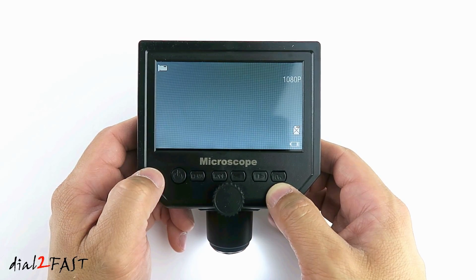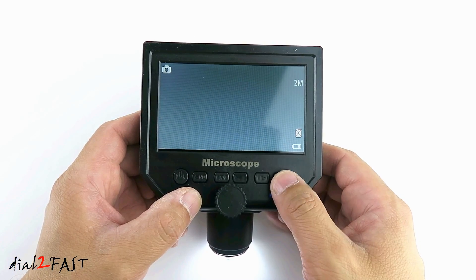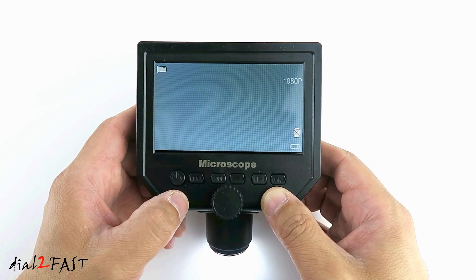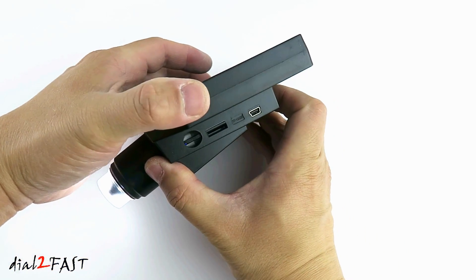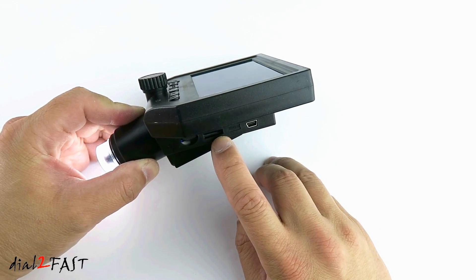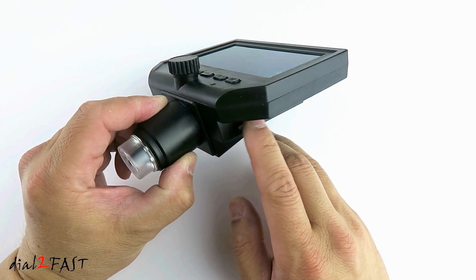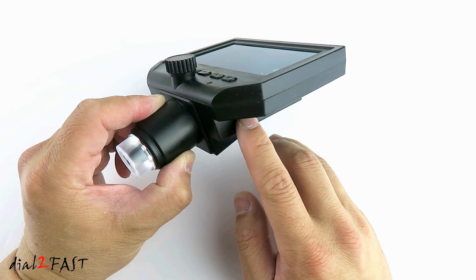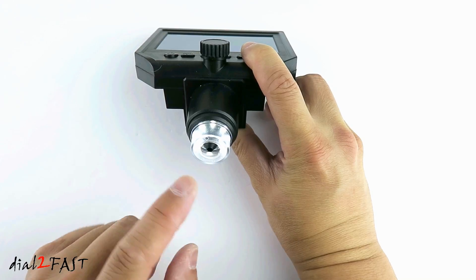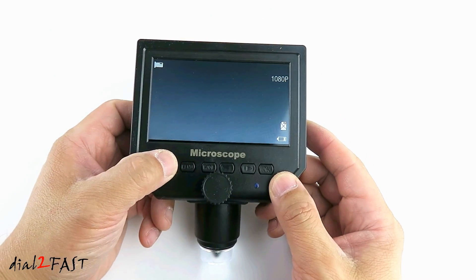Press menu again and now we're back to the main video screen. You can also press the mode button right here. If you have a memory card installed and you press the OK button, it'll take a snapshot. Press mode button for playback, press it again to go back to video mode. On the side we have a mini USB connector for charging the unit, the micro SD memory card slot, and this dial here is for adjusting the brightness of the LED. Looking at the bottom, in the middle is the camera lens, and around the sides are the LEDs for illumination. To turn off the unit, press and hold the power button.